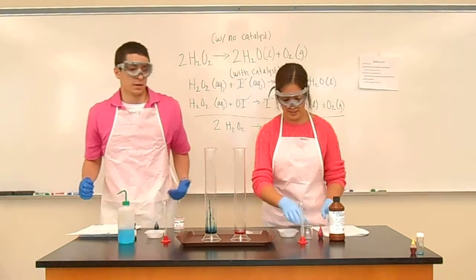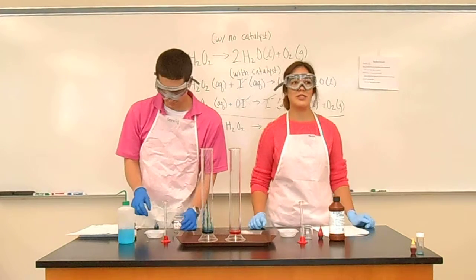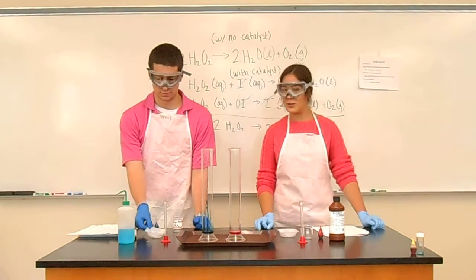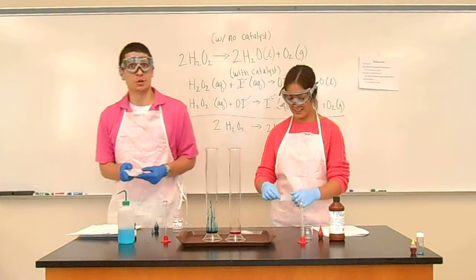Okay. As you can see, nothing is actually happening. You can just swirl it around and nothing will happen. It would probably take a whole day for something to occur if we just left it. Since we don't have a whole day, we're going to add our catalyst, which will actually start our reaction. Are you guys ready for this? I don't know what's going to happen.